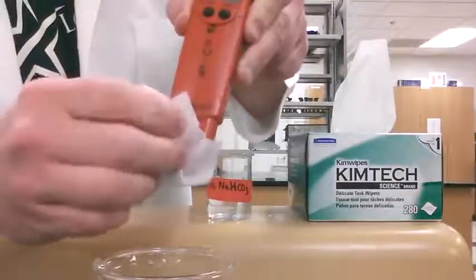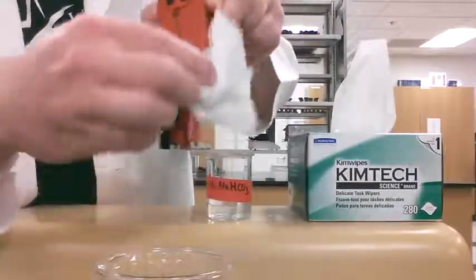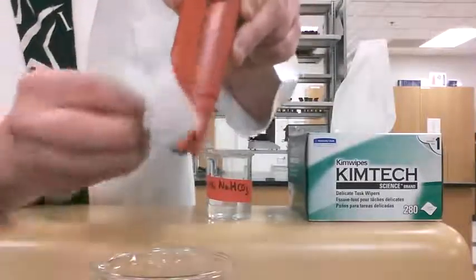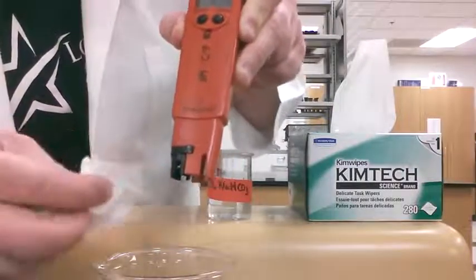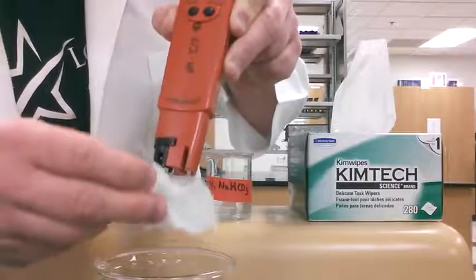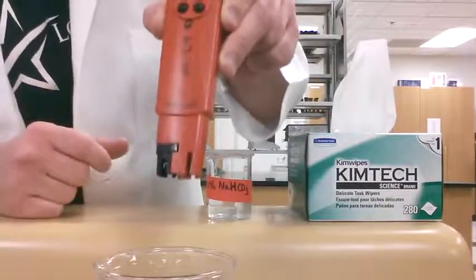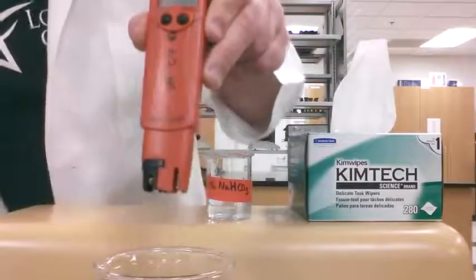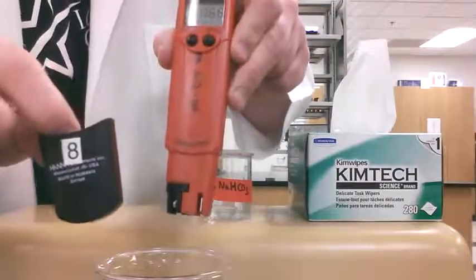Give it a nice shake, then wipe around the electrode with a chem wipe — make sure to get all that solution off the outside and off that little glass ball, the actual electrode bulb. Tap it very gently with the chem wipe.